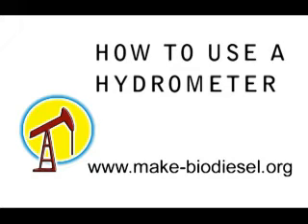Hi, I'm Rick with MakeBioDiesel.org, and in this video I'm going to show you how to use a hydrometer to test your methanol for water.